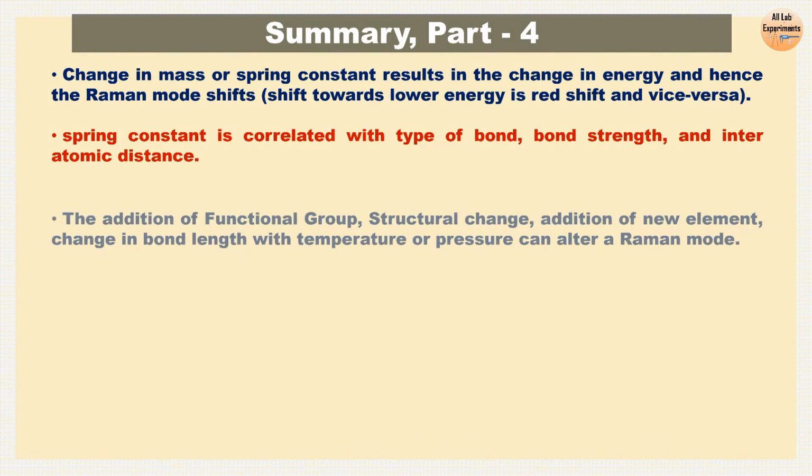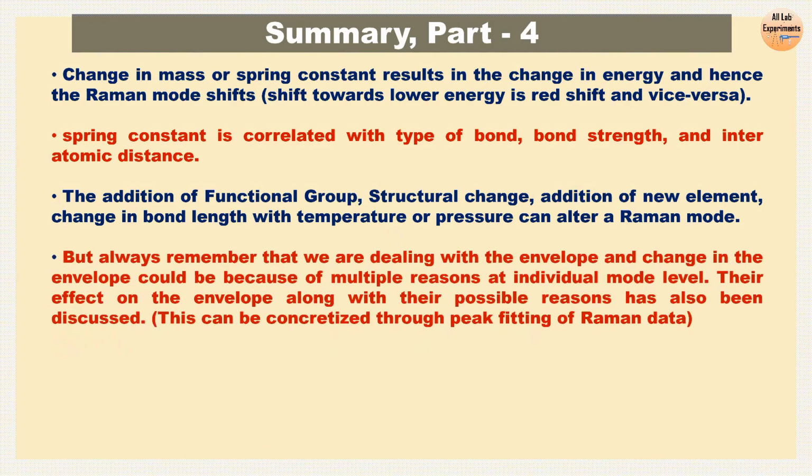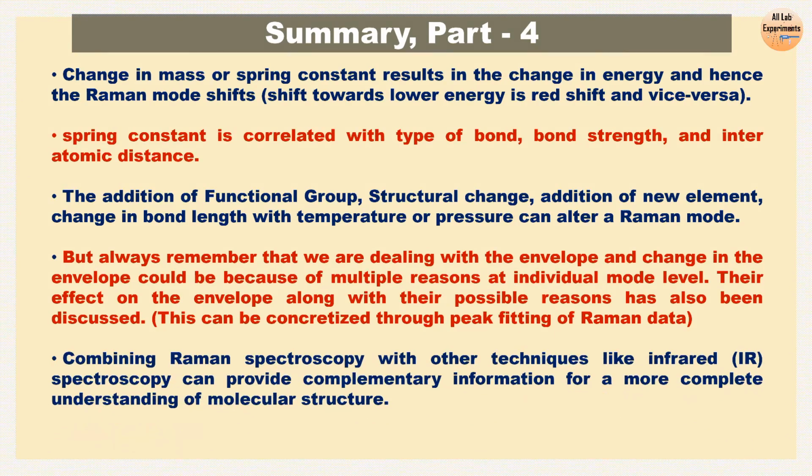These Raman modes can be altered by the presence of functional group, any structural change, any environmental change may change a Raman mode. But always remember the main thing, that we are dealing with the envelope, not with the individual modes. So what is happening under the blanket is far more important to interpret rather than just looking from the top, which you can easily understand just by applying some knowledge of your material and its structure. So Raman spectroscopy along with the information provided by IR spectroscopy can complement each other and can provide the complete understanding of the molecule. So this is the characterization part.